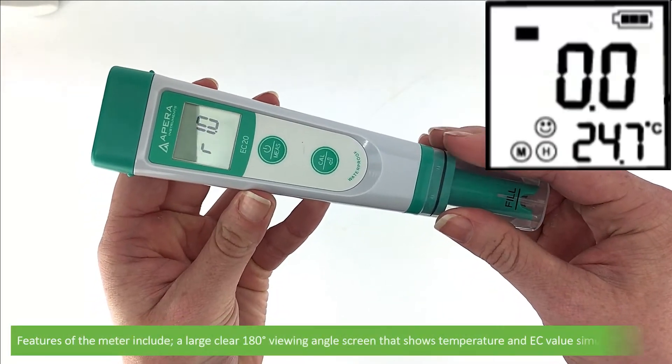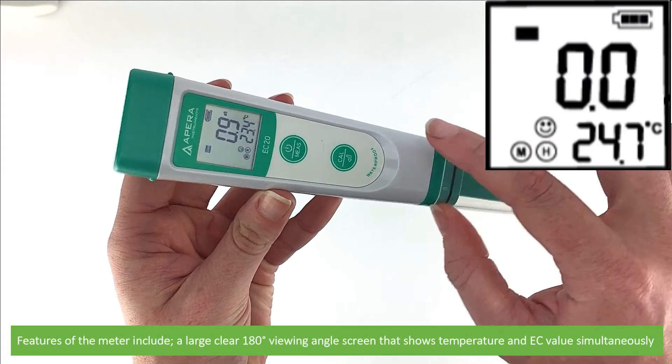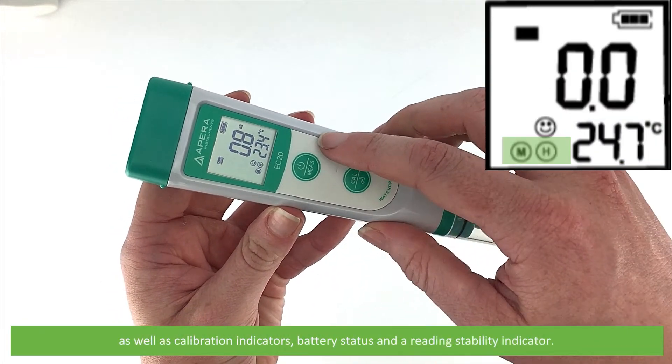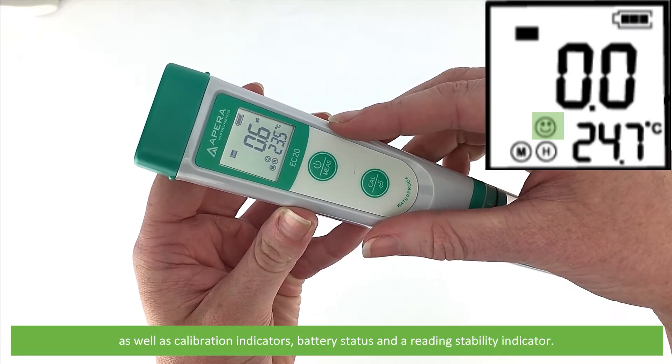Features of the meter include a large clear 180 degree viewing angle screen that shows temperature and conductivity value simultaneously, as well as calibration indicators, battery status, and a reading stability indicator.